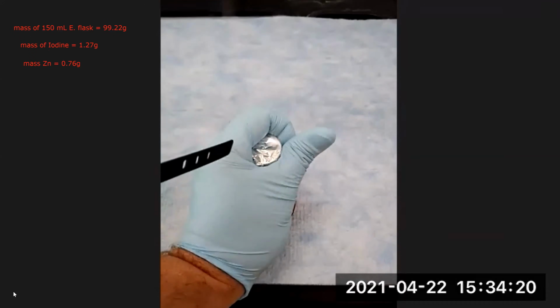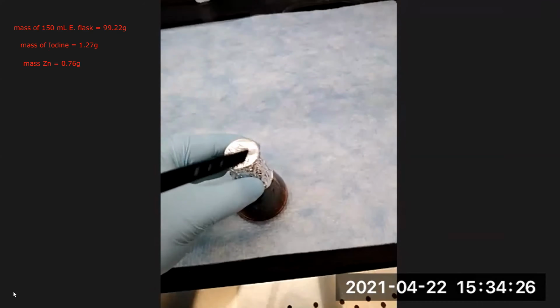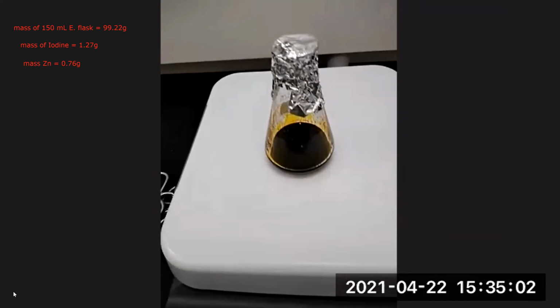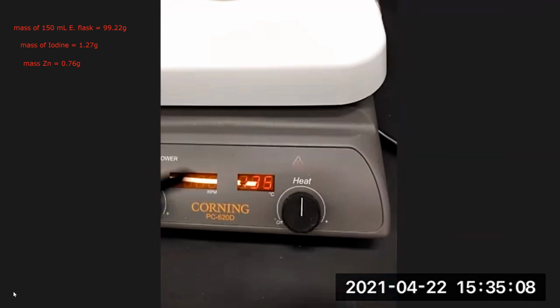So now we're going to heat the sample, and this is where it takes a long time for it to go from a dark brown to a colorless solution. You put it on the hot plate, and you want to get it to where it's heated to a gentle boil, so not too much.